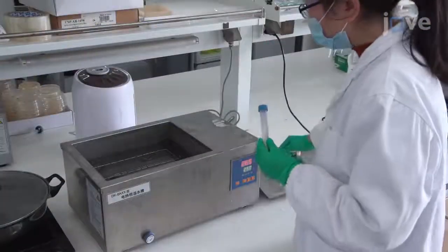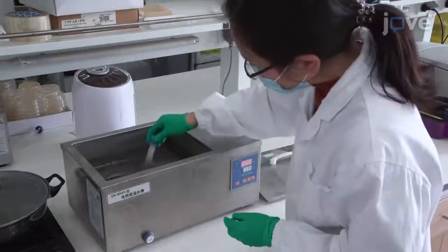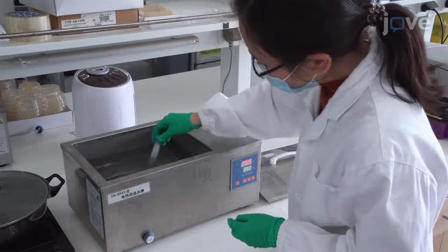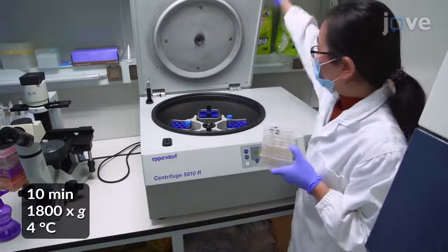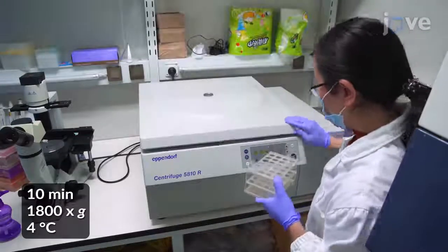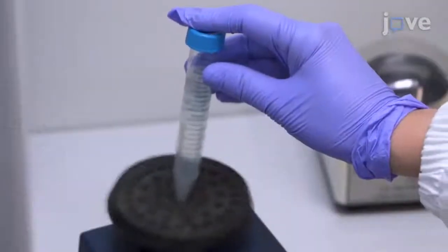To generate working concentrations of virus, thaw the cell solution in a 25°C water bath with constant shaking before pelleting the cell debris by centrifugation. Then transfer the supernatant into a new sterile 15 mL tube.